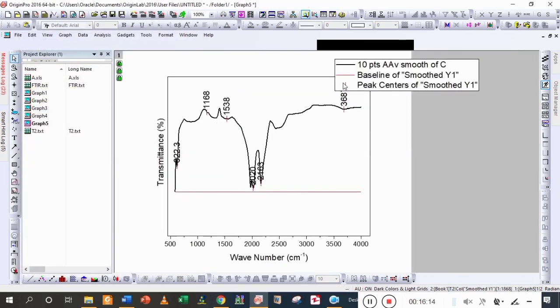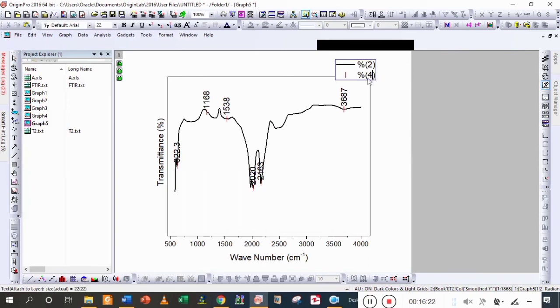So I'm going to hide the baseline values because it is not necessary. So here I'm writing its name. So here it is a standard form of transmittance plot which can get from absorbance data.